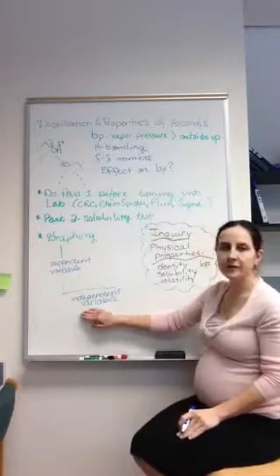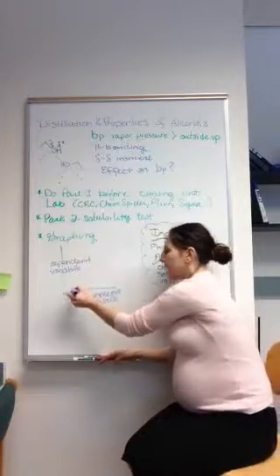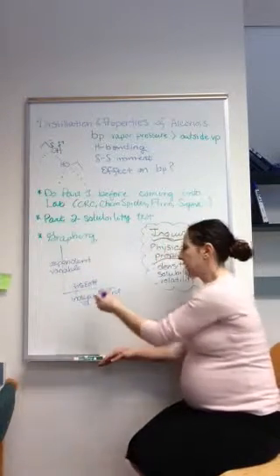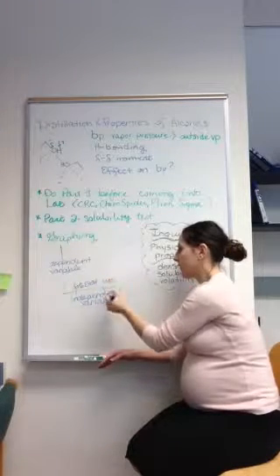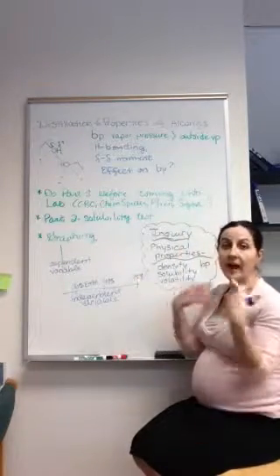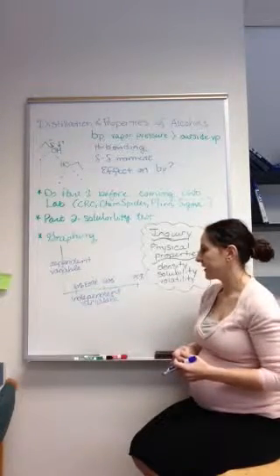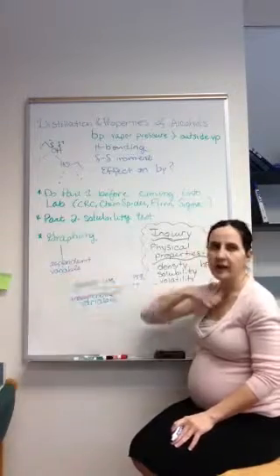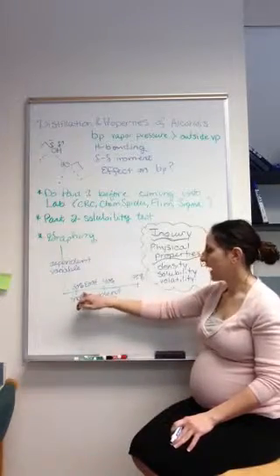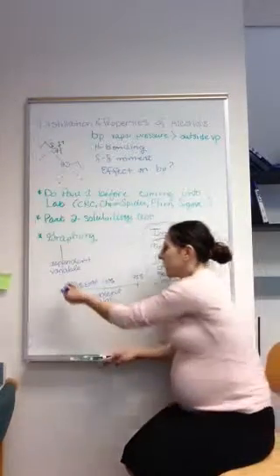By independent variable, these are the things that we're varying. So if you're looking at a solubility test and you have 30% ethanol in water, and then you have 40% ethanol in water, and then let's say you have 75% ethanol in water, you're actually controlling that. You have the power. You're putting the ethanol in the water and then conducting a test. And then the dependent variable is whatever numbers come out of that. And so let's say you're looking at how long it takes to evaporate. So you could have different rates.